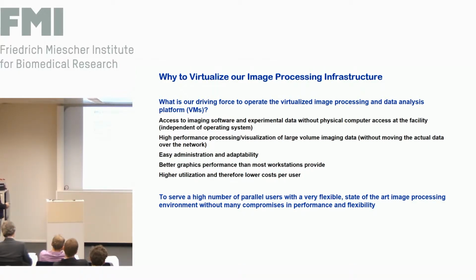Another advantage, it's easy to administer and can be adapted. That's what we heard basically. So you can have different flavors of virtual machines. You have okay-ish graphic performance. It's probably not the best in its class, but it's at least better than what most people have. So most people can work. That's the aim. And obviously, a single workstation standing in some lab is used only some of the time, but we have a higher utilization, and obviously it's lower cost.